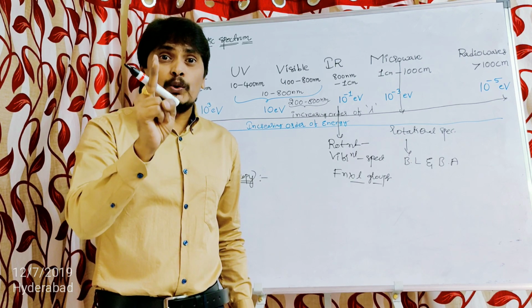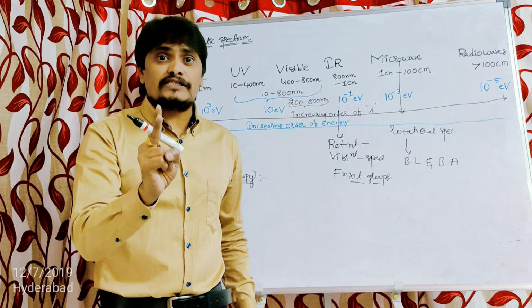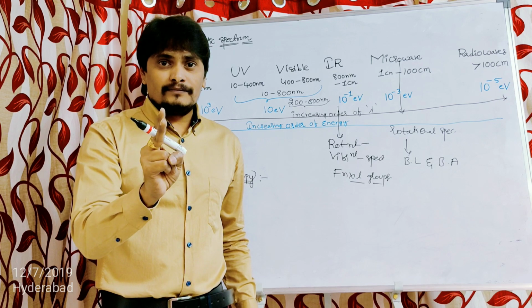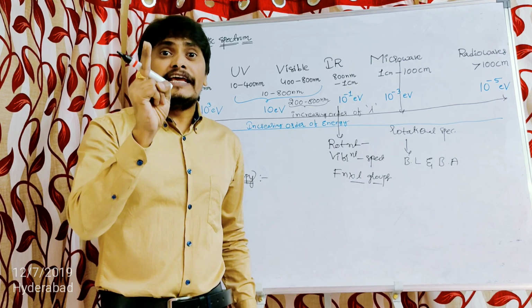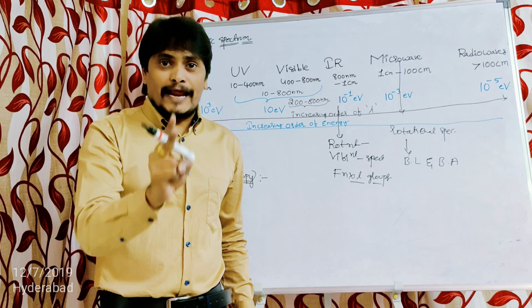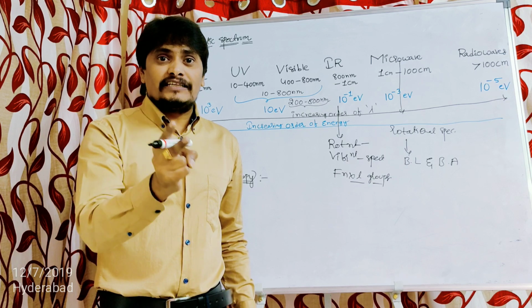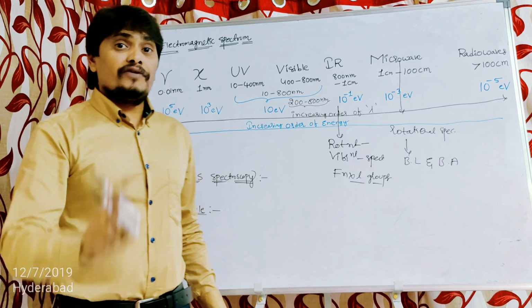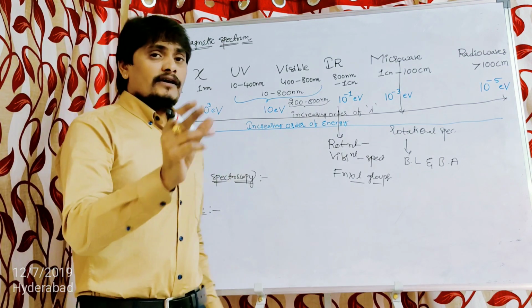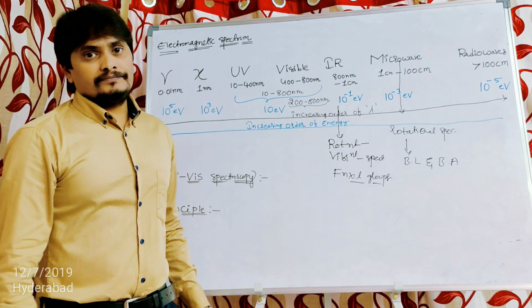Why is the 10 to 200 nanometers wavelength range not used for recording the UV visible spectra, even though the minimum value is 10 and the maximum value is 800 nanometers within the range of UV visible? Right. Now, let us come back to our UV visible spectroscopy.